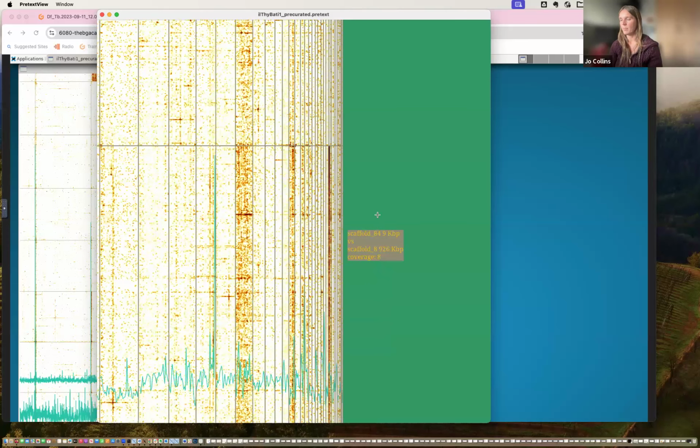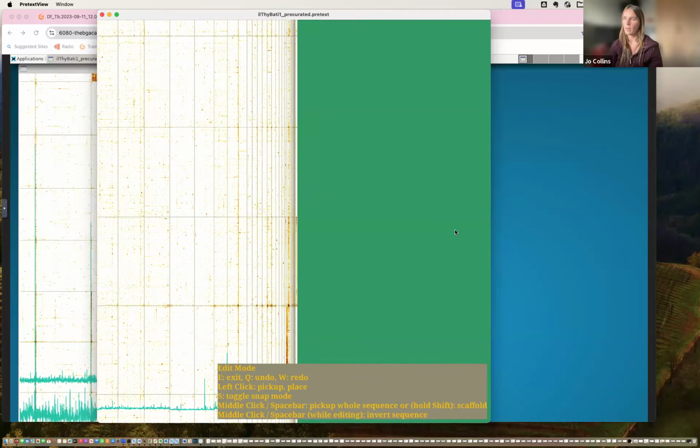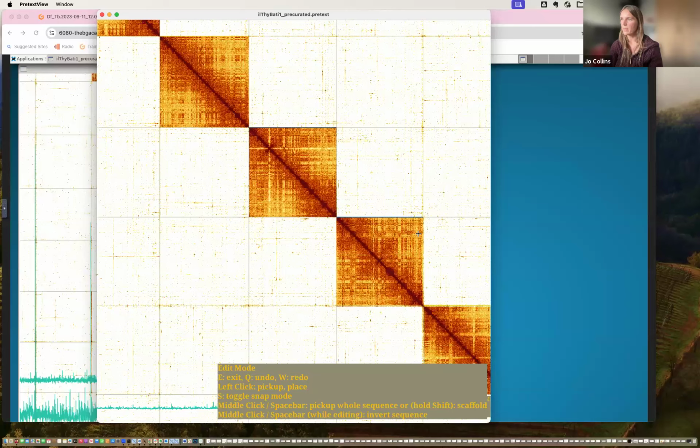But often with repeats, we see mappings to multiple chromosomes, or it's not possible to get a proper handle on where those shrapnel scaffolds locate within that chromosome. So it's best not to spend too long dealing with those. But in this case, it clearly goes on the end, so we can usually roll out and take our small shrapnel piece over.